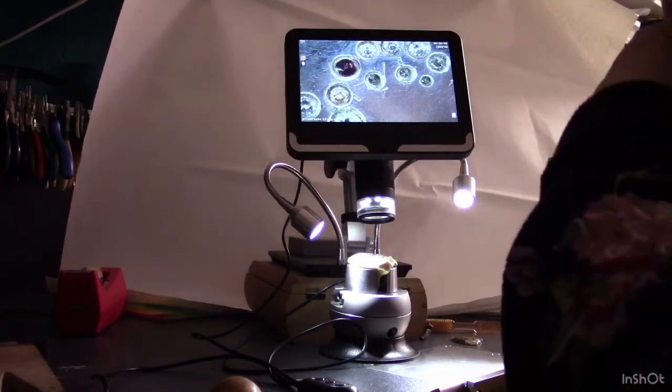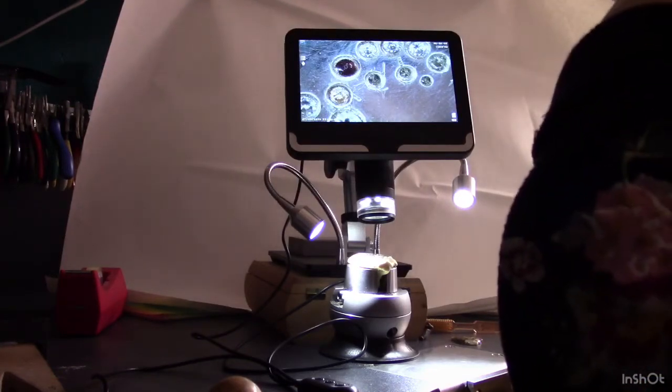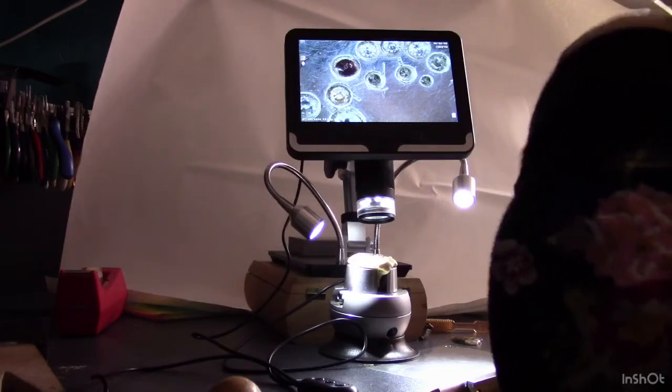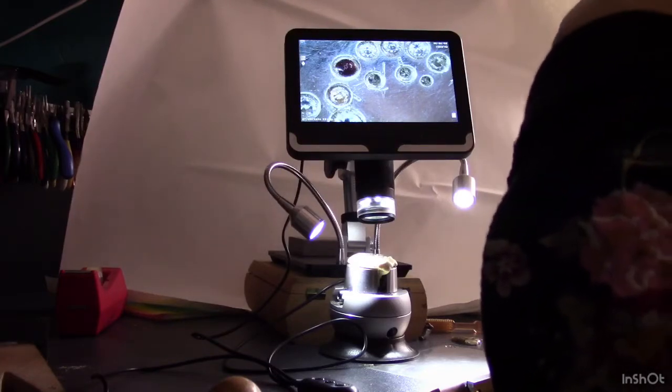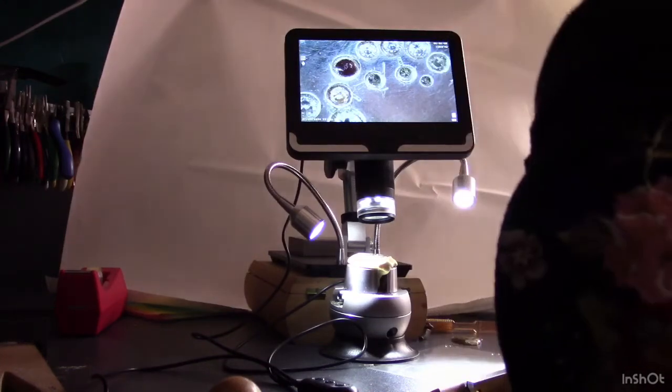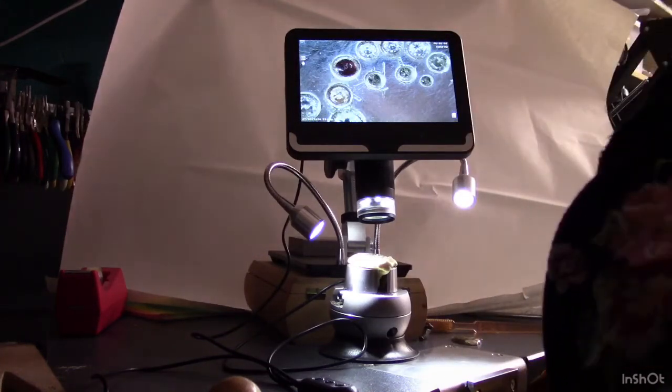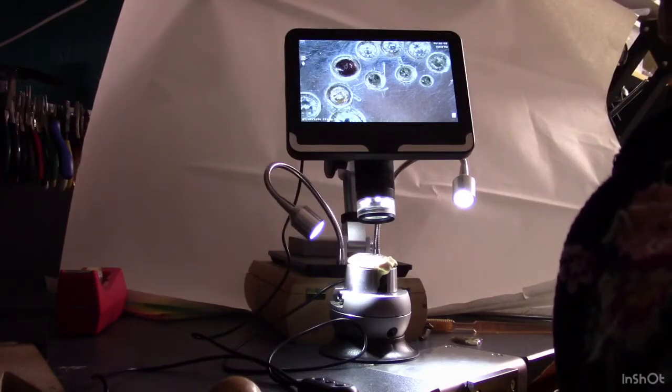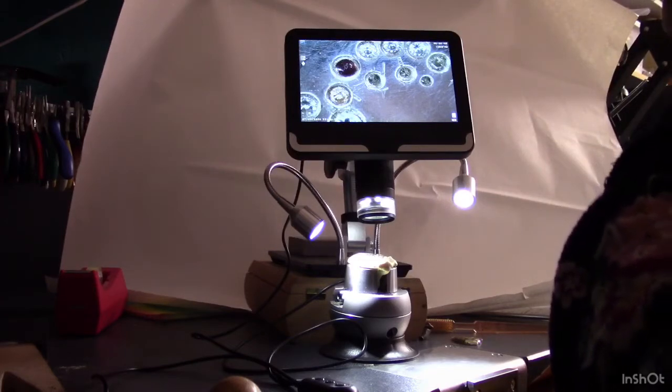And I recently stumbled into this on one of my forays across the internet. And it is a little microscope made by a company called Coolertron, that's K-O-O-L-E-R-T-R-O-N.